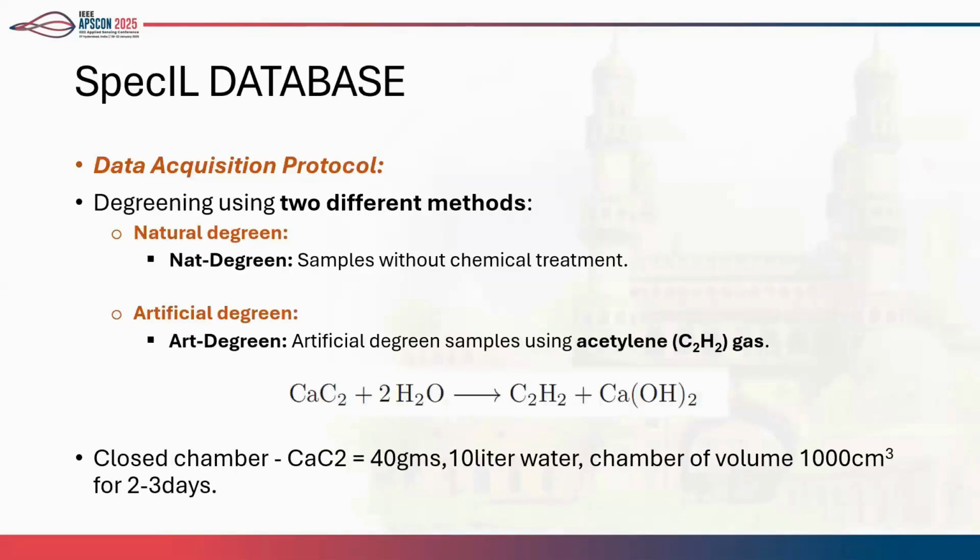In the first case, we developed the dataset. The idea was to develop the protocol, which we did with our local ICAR institute in Goa, wherein we understood how the protocol has to be designed for natural and artificial degreening of the lemon.